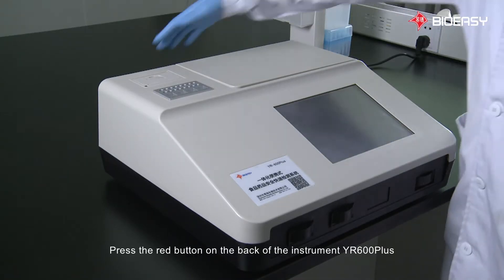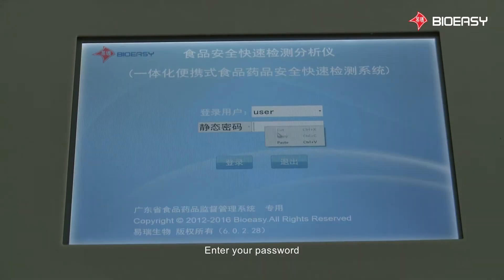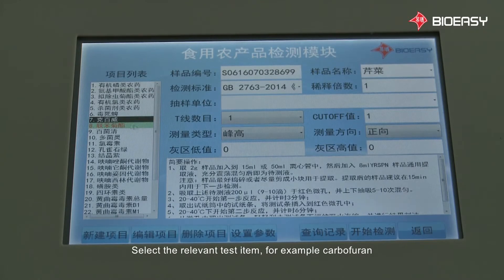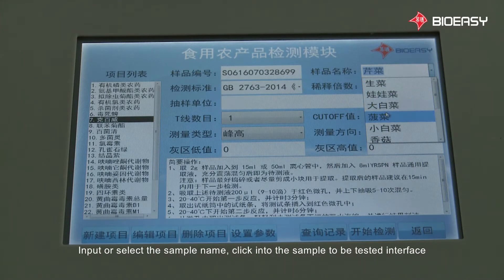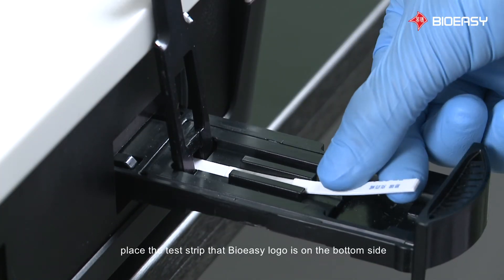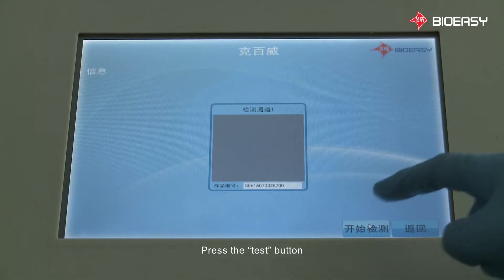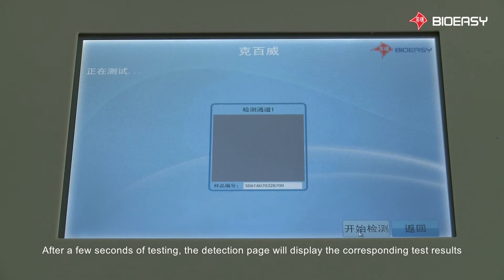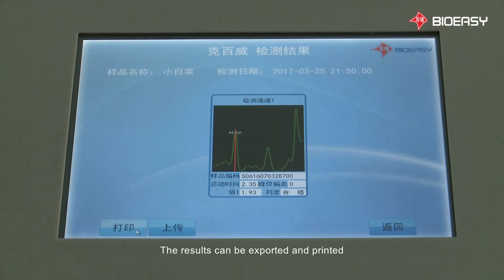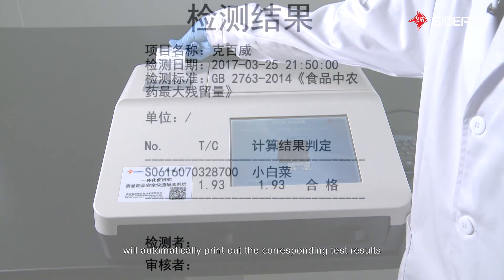Interpretation by reader: press the red button on the back of the instrument YR-600+. The monitor will automatically load the home page. Enter your password and enter the agricultural products testing module. Select the relevant test item, for example Carbofuran. Input or select the sample name and click into the sample to be tested interface. Open the tray, place the test strip with the BioEasy logo on the bottom side, and close the tray. Press the test button. After a few seconds, the detection page will display the corresponding test results. The results can be exported and printed by pressing the print button, and the embedded printer at the top left of the instrument will automatically print out the corresponding test results.